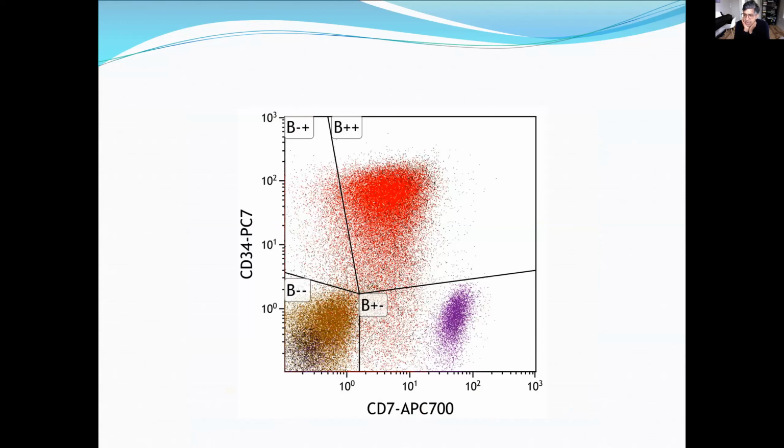Yeah. And yes, Pratap is already asking leading questions. And yes, so this is CD34 and CD7. So normal T cells express CD7. So these are normal T cells. And these are CD34 positive cells, which are immature cells. And when immature cells with CD34 express CD7 dimly like that, that can never be good. And these are your background normals.